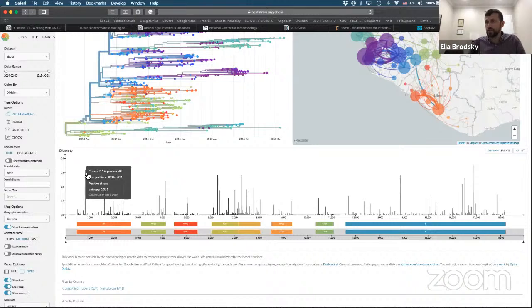So 357, right? So this is the highest one, the L protein. Yep, it is difficult to see, but this just gives you some insight into how important it is to select the correct data and the correct analysis for what you are trying to do.